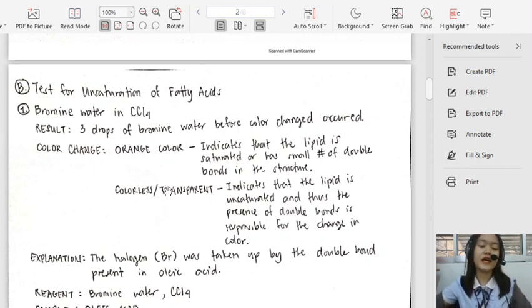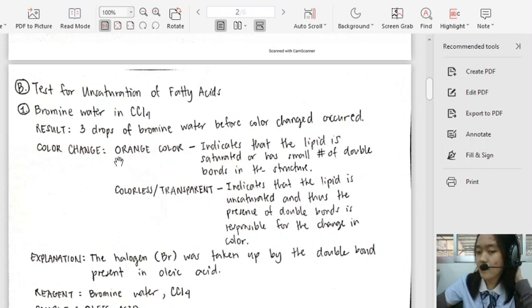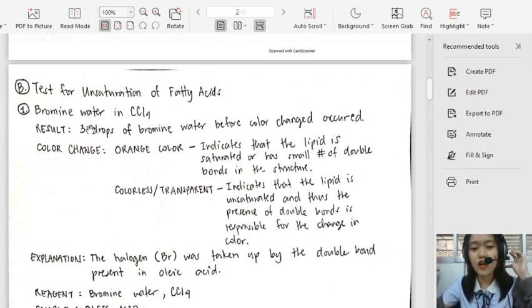So, ang positive ay, ang kinukuha mo dito is how many drops, no? So, binigay ko na 3 drops. So, maliit lang, no? 3 drops lang. Why? Because your oleic acid contains only ilang bond lang ang meron sa kanya. Sa formula niya, isa lang, di ba? If I'm correct. Okay, sa oleic acid ninyo. So, lesser yung number of double bonds found in the structure of your oleic acid. Okay, kaya, maliit lang na drop, napuno na siya agad ng bromine halogens. Kaya, mabilis nag-change yung color niya.